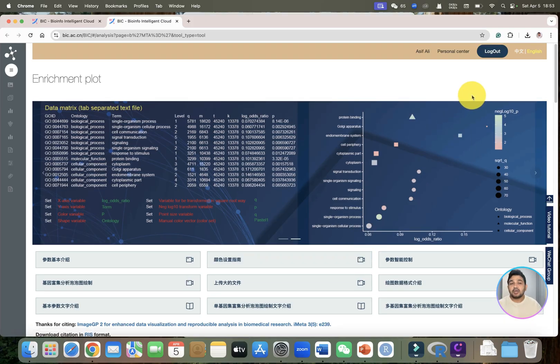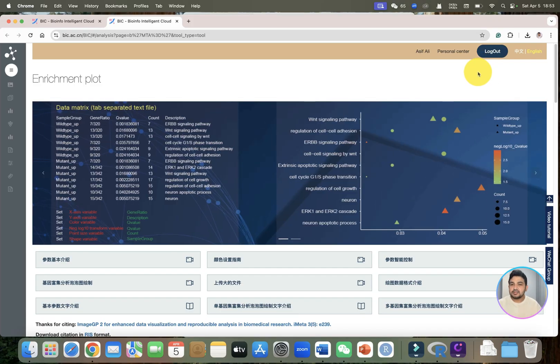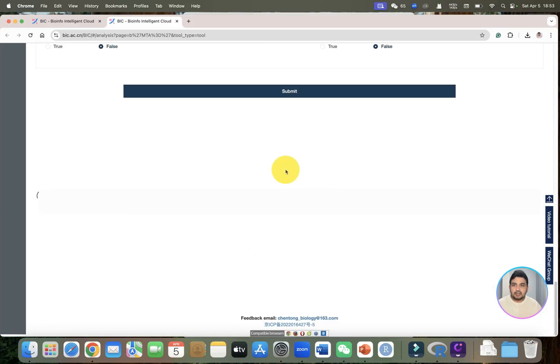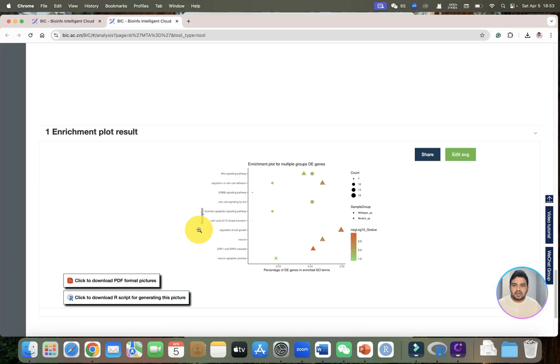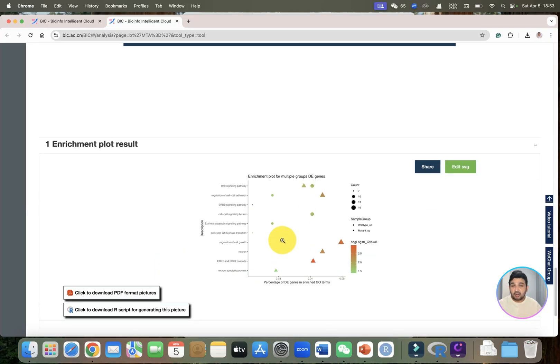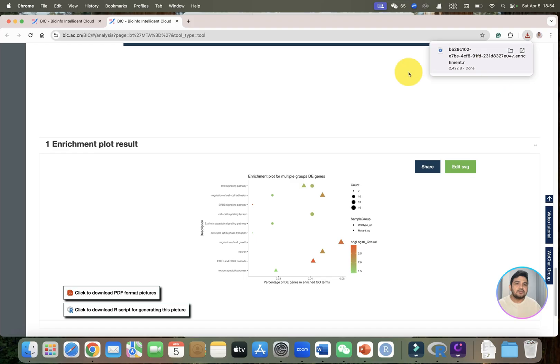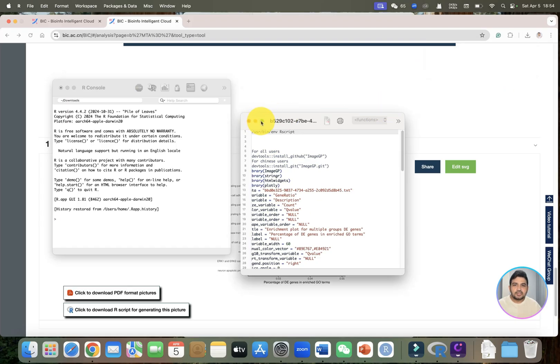It does not require any login — if you want you can create a login, but it is not required. Once you submit, our plot is ready. The best thing I like most about Bio Info Intelligent Cloud is that the R script is ready and we can download it with a single click to use individually in R later.